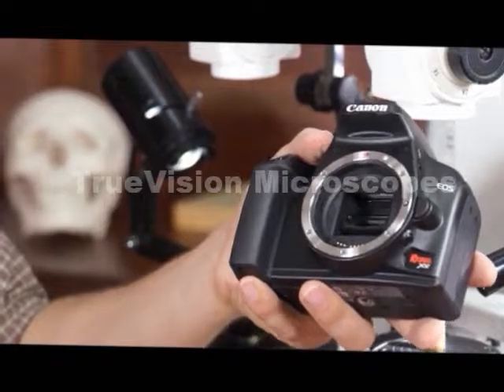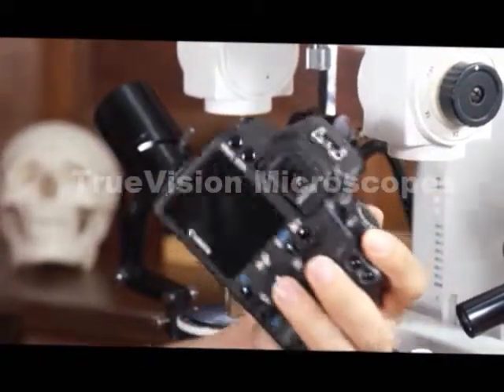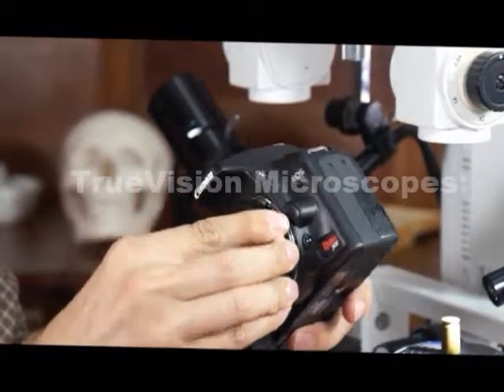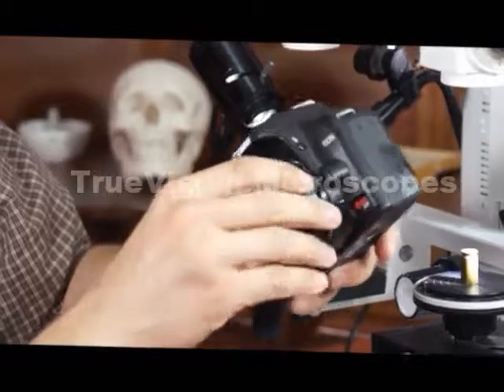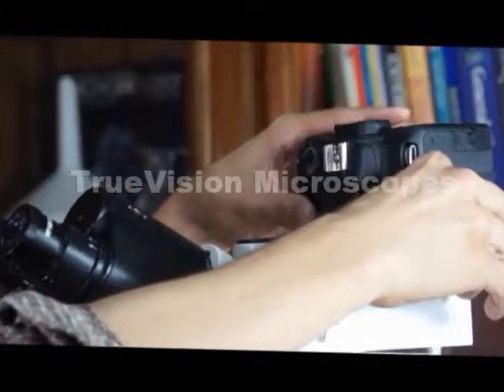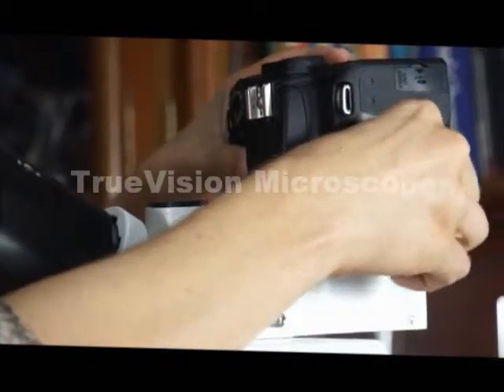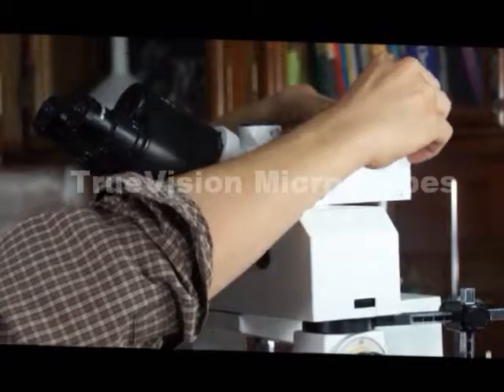Here we have a Canon SLR digital. This particular model is an EOS Rebel XS. You could use Nikon or whatever brand. The point is that it's an SLR camera and a digital. We have a Canon T adapter. This is a T adapter. We have the proper T adapter to fit the camera. At this point, we pull the light diversion knob out, and now we can take photography with our DSLR camera. I'll cap this port. You want to keep them capped so you don't get dust in them.